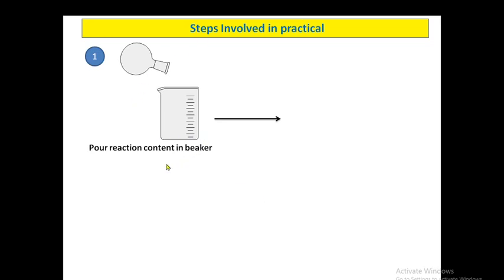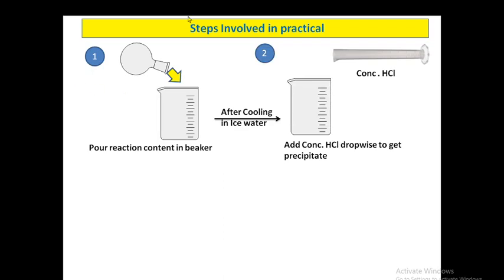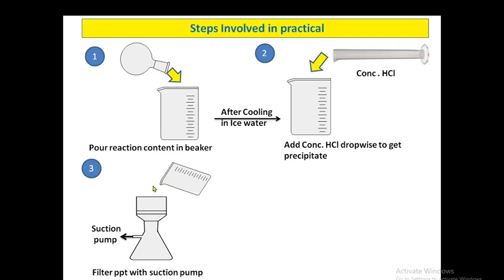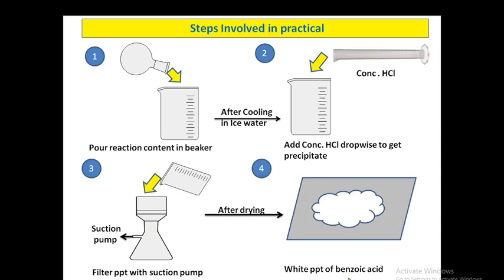All the reaction content is now poured into a beaker. After cooling in ice water, add concentrated HCl into the solution — you will get the precipitate of benzoic acid. Then filter the whole precipitate at the suction pump. Here is the suction pump — you filter all the precipitate and you will get the white precipitate of benzoic acid after drying.